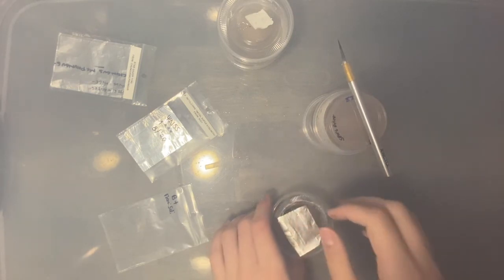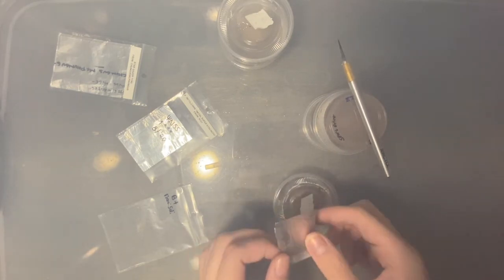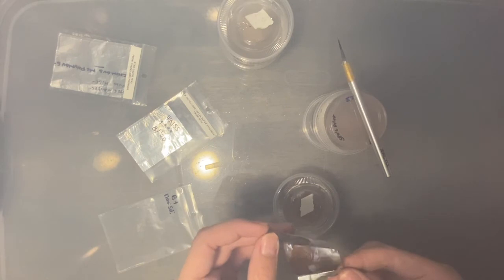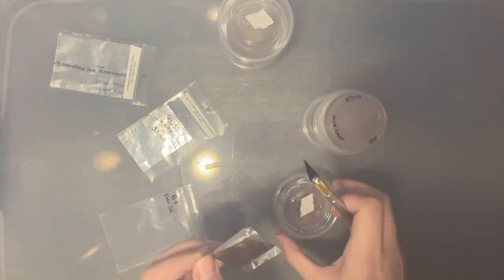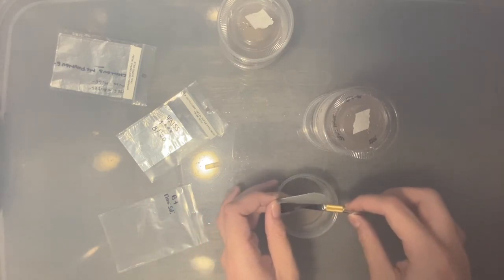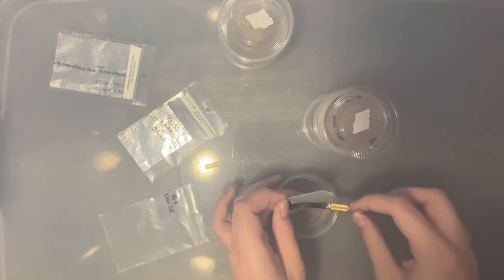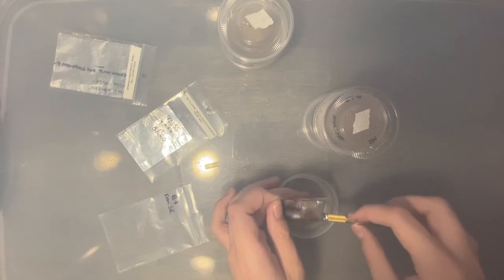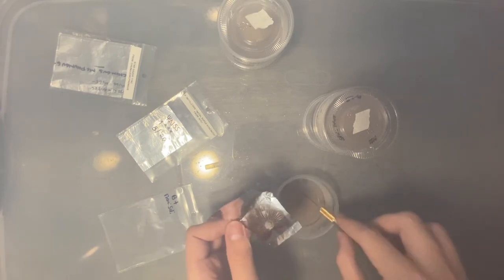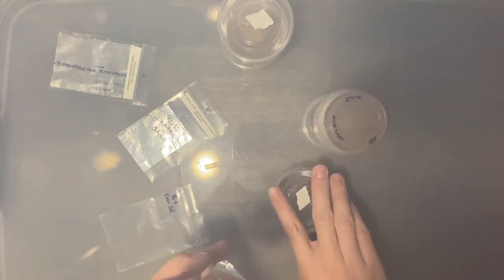So I'm going to pop the lid. I'm going to go ahead and open the print a little bit, figure out where I want to hold it from. So I can hold it from right there. I'm gonna take the lid off, and then I'm gonna angle it down and give a nice generous scraping. Okay, dip the knife in because there's spores still stuck on the knife. Alright, I'm gonna close this print back up. Try not to get it to touch my finger.